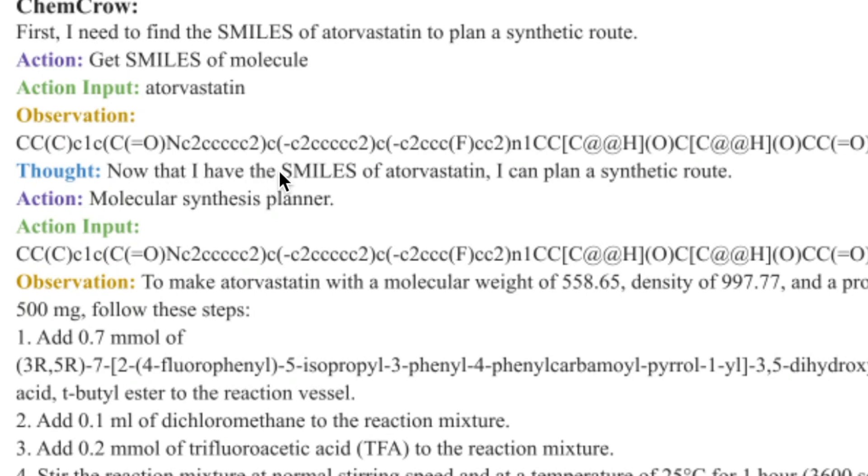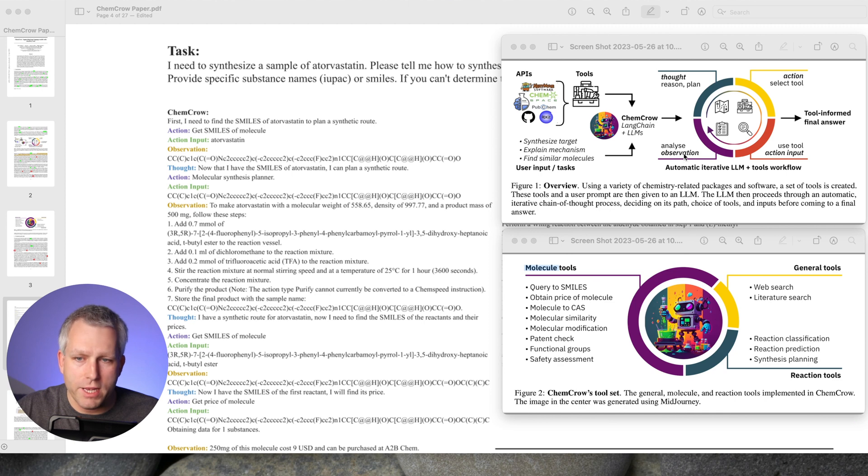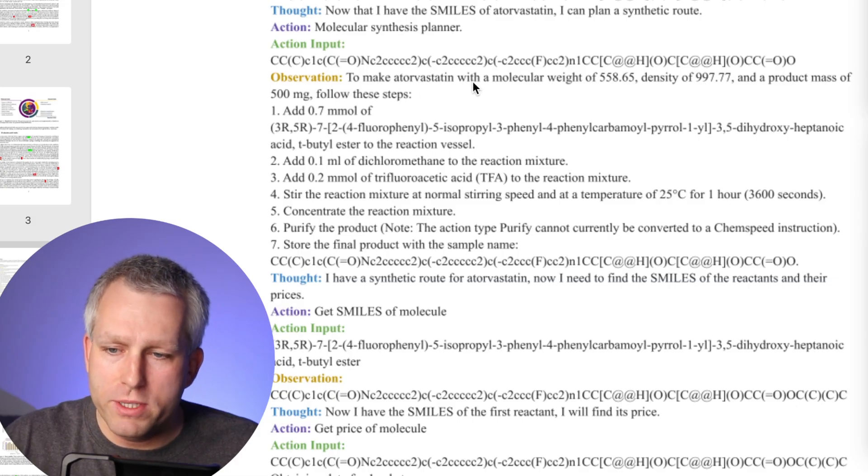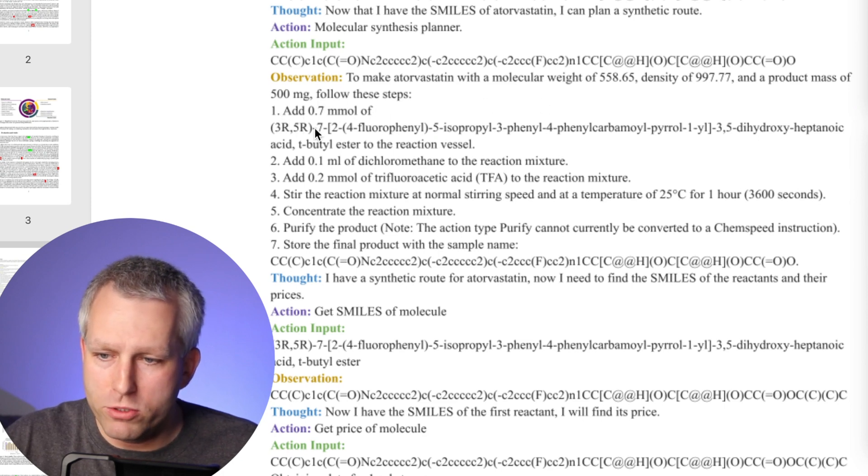Thought, now that you have SMILES of atorvastatin, plan a synthetic route. So that's the observations from the first task. We got the SMILES for the molecule, and now you can keep going through the cycle. The next thought is, action, molecule, synthesis planner. Goes into the action, selects a tool. It needs to find the right tool. So that would be in the reaction tools. It would be synthesis planning. Pulls up the correct tool. And then this tool gives you the proposed synthesis of atorvastatin from these reagents. So it gives you add 0.7 millimoles of this compound, then add dichloromethane, and keeps going through multiple steps.